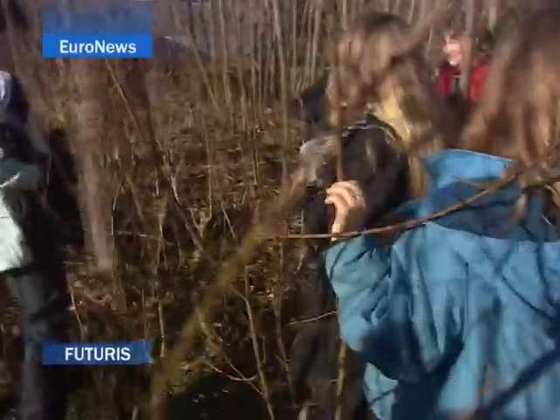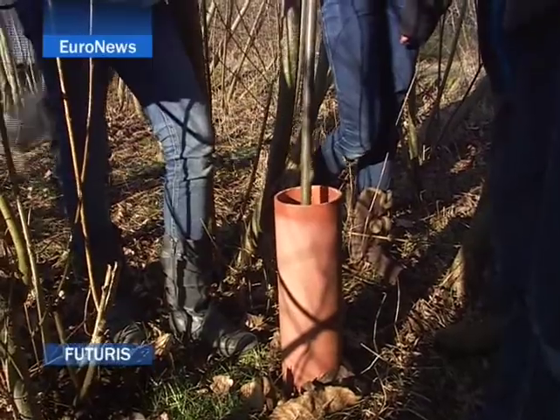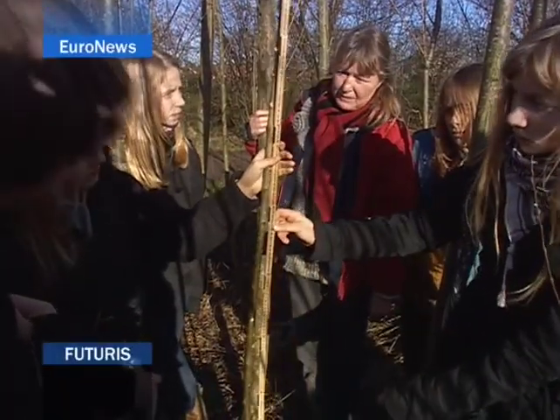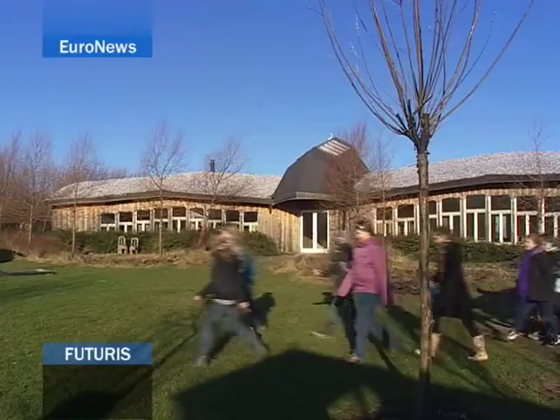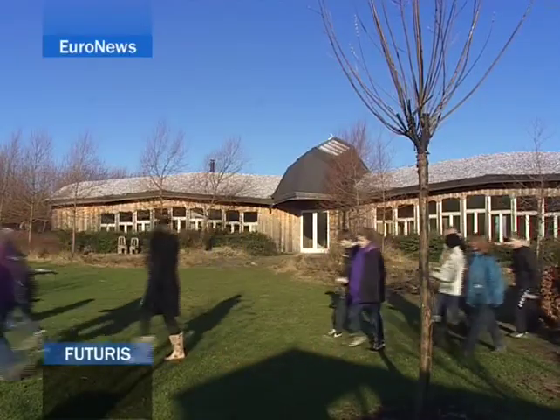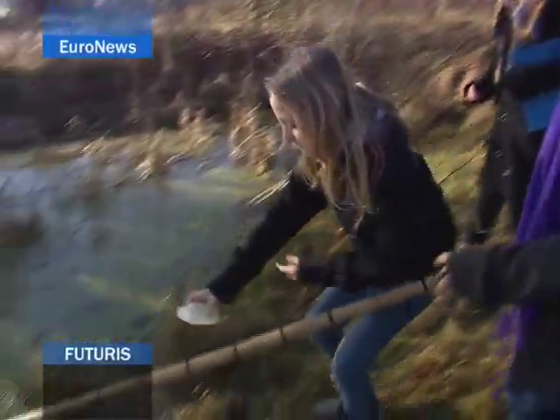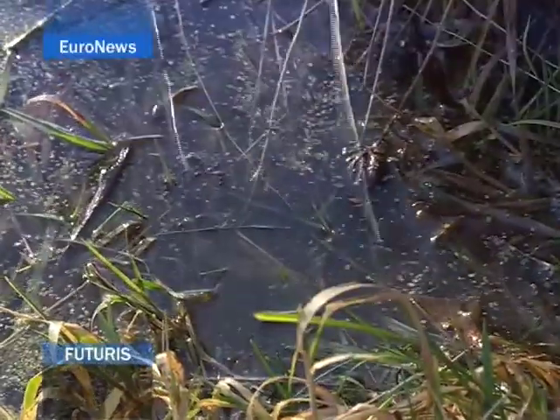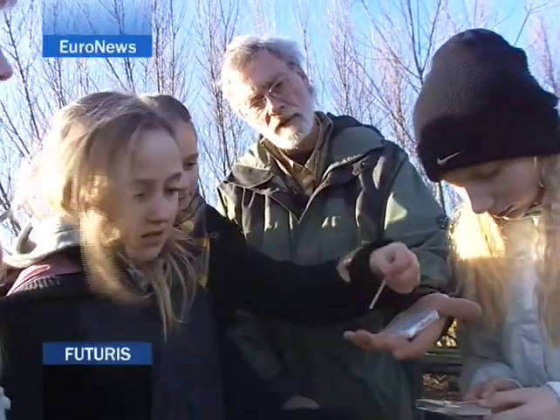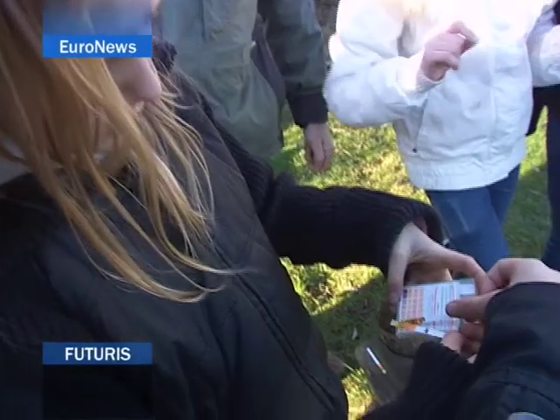Wastewater is cleaned here with the help of these willows. The roots filter many of the polluting particles in suspension. Students measure the level of underground wastewater and its effect on the tree's growth. Partially cleaned wastewater ends in this pond, where the rainwater, natural sediments and plants clean it more. Students measure the water's pH and then, with the help of small colour matches, water's great enemies: nitrates, phosphates and ammonia.